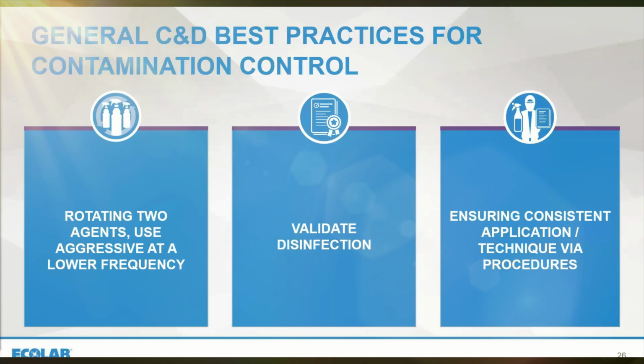Or you could even replace that sporicidal manual disinfection with automated decontamination using hydrogen peroxide, which, although you can't be present when that's happening, which is a good thing, breaks down into water and oxygen, so it's much safer for the user once the decontamination is complete.